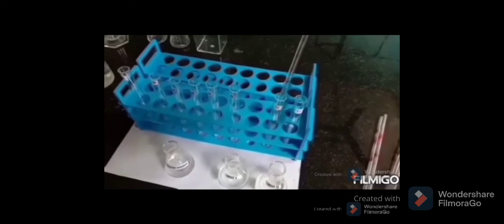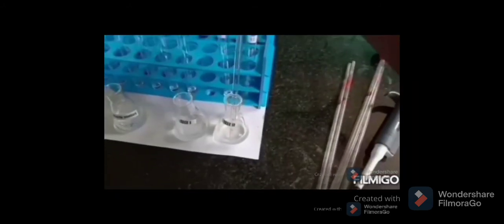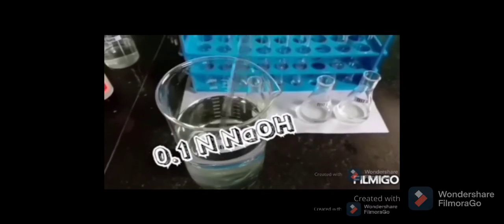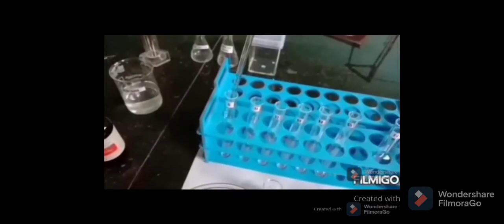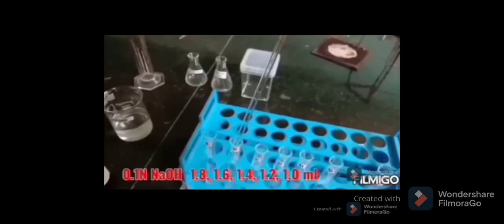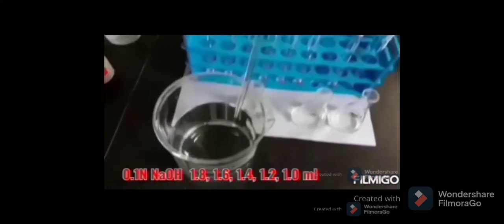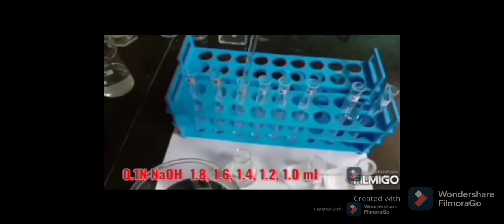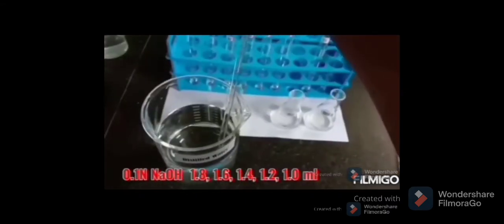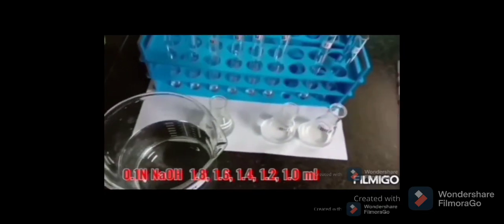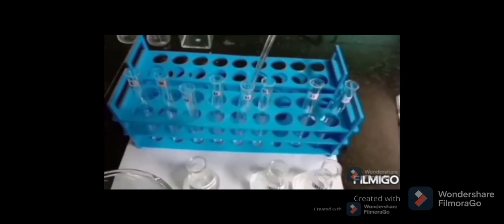One ml each of unknown test 1 and test 2 are added to tubes marked T1 and T2. This is followed by addition of 0.1 normal NaOH: to the blank, 2 ml; from S1 to S5, add 0.1 normal NaOH exactly 1.8, 1.6, 1.4, 1.2, 1.0 ml. Further, 1 ml is added to T1 and T2. So all the tubes are now made up to 2 ml.